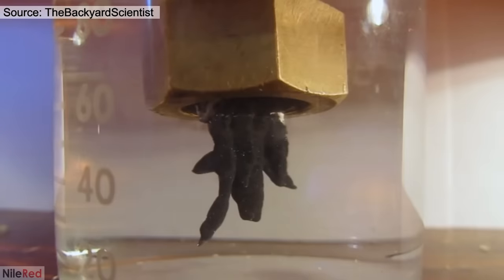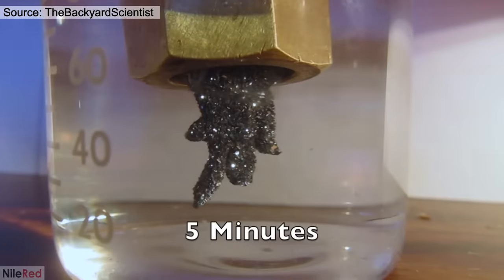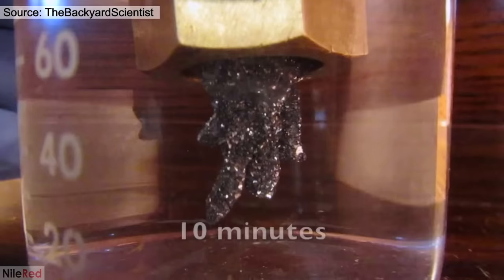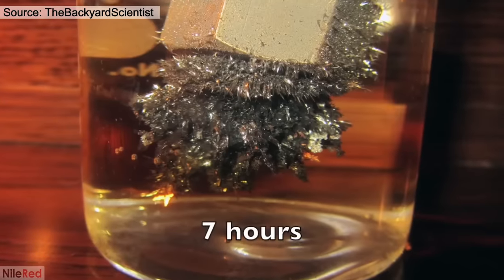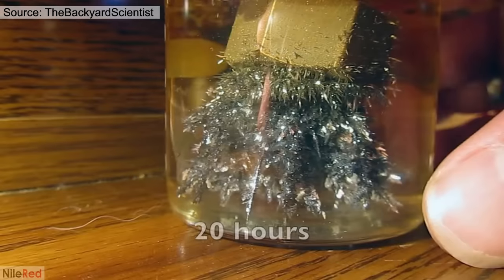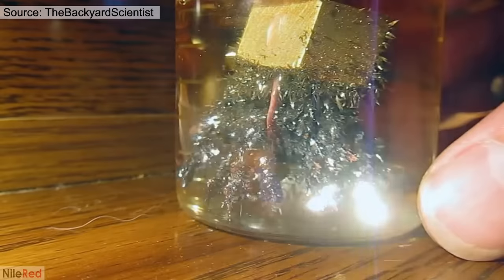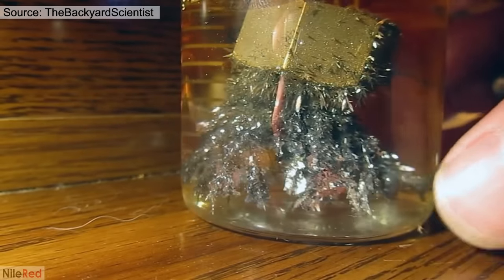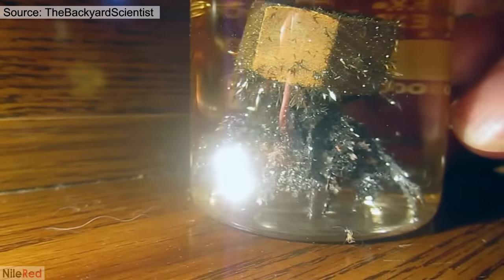A while ago, I saw a cool video by the Backyard Scientist and I decided to try it for myself. It's a very old and relatively simple experiment, but it's still quite interesting. When a piece of zinc is added to a solution of a soluble lead salt, crystals of lead metal will start to form. Early chemists called this the tree of Saturn because they believed there was a connection between planets and metals, and they associated lead with Saturn.